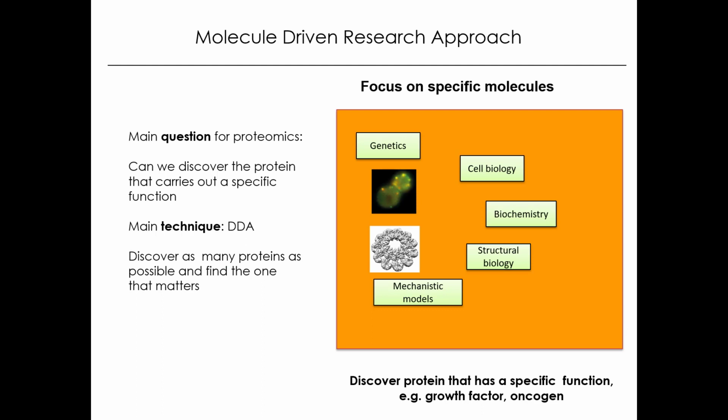So now let's assume we can do these measurements. We can either use the data-dependent, the shotgun methods, and map out most of the proteins in a sample, or we can use these DIA methods and do large-scale data sets of cohorts, like clinical cohorts. Now I would like to discuss briefly how we can imagine that these results are being used to learn something biologically relevant.